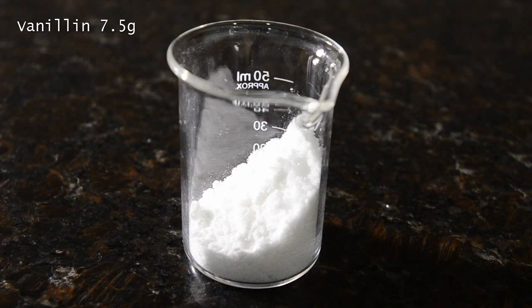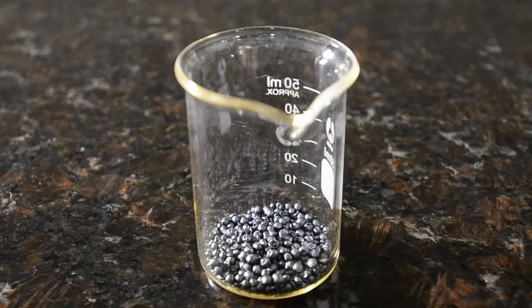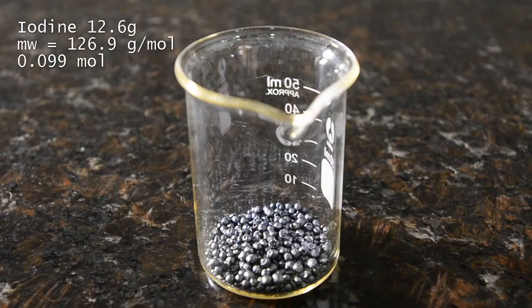We then weigh out 7.5 grams of pure vanillin powder. Pure vanillin is available under the Rovanil brand at professional bakery suppliers. Next, we weigh out and prepare 12.6 grams of solid iodine.